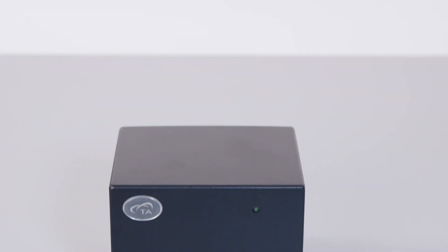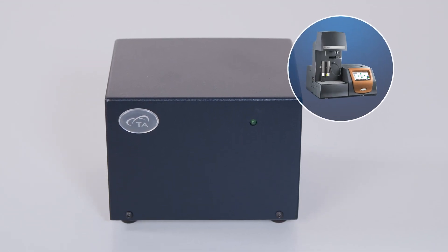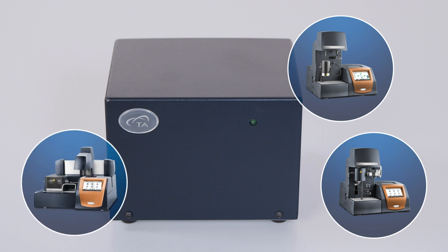The Blending GDM is an accessory for use with the TGA Discovery 550 and Discovery 5500, as well as the SDT Discovery 650.